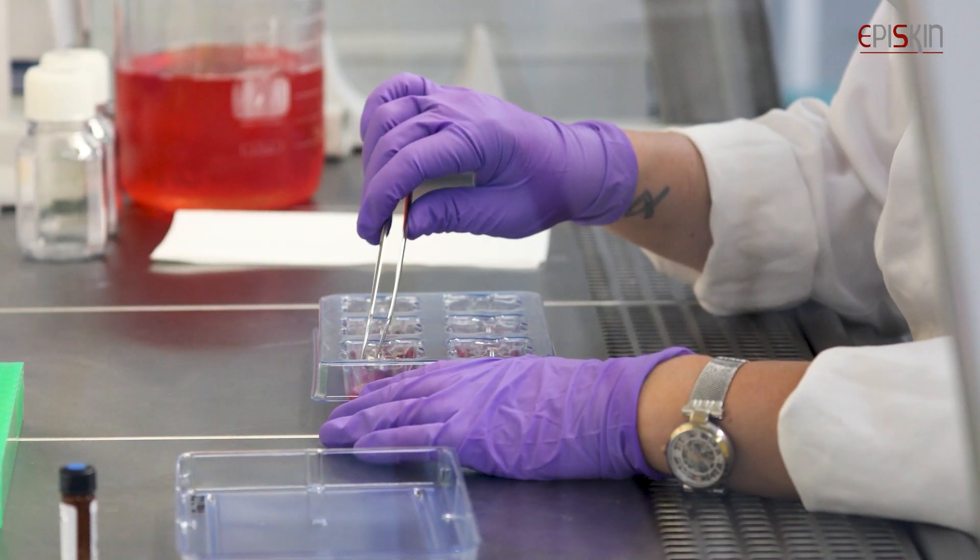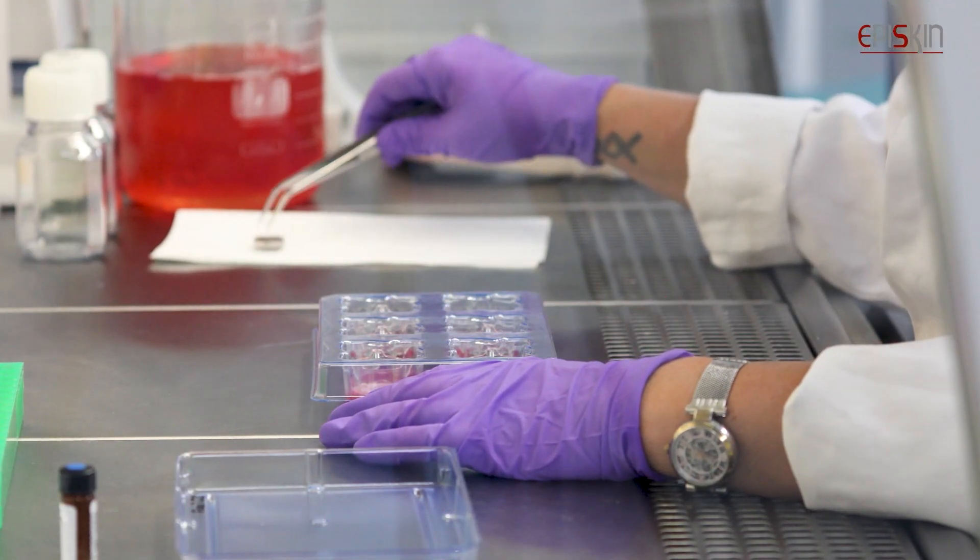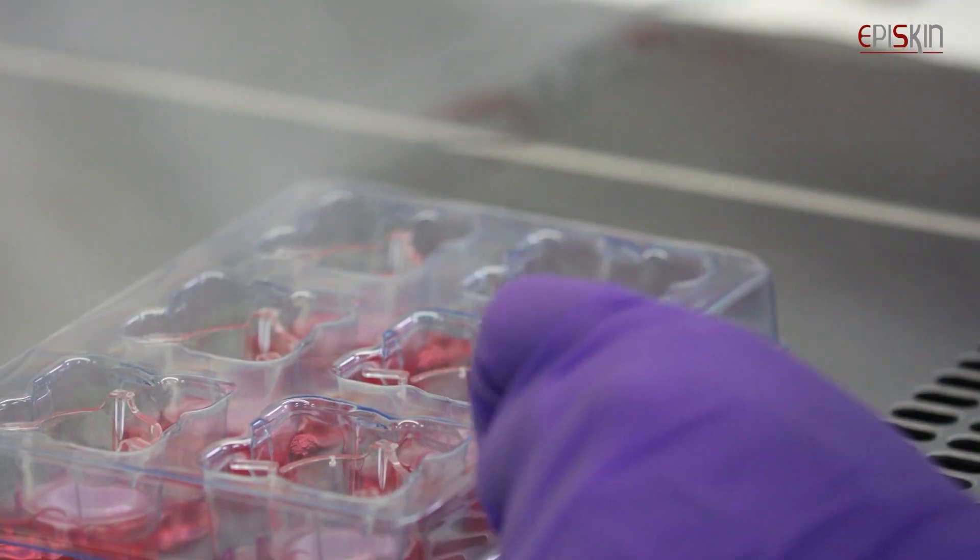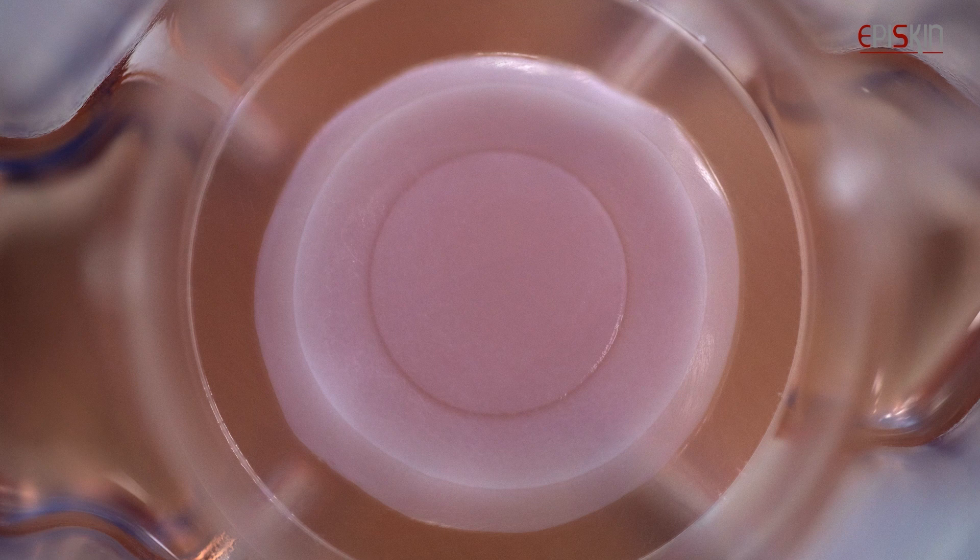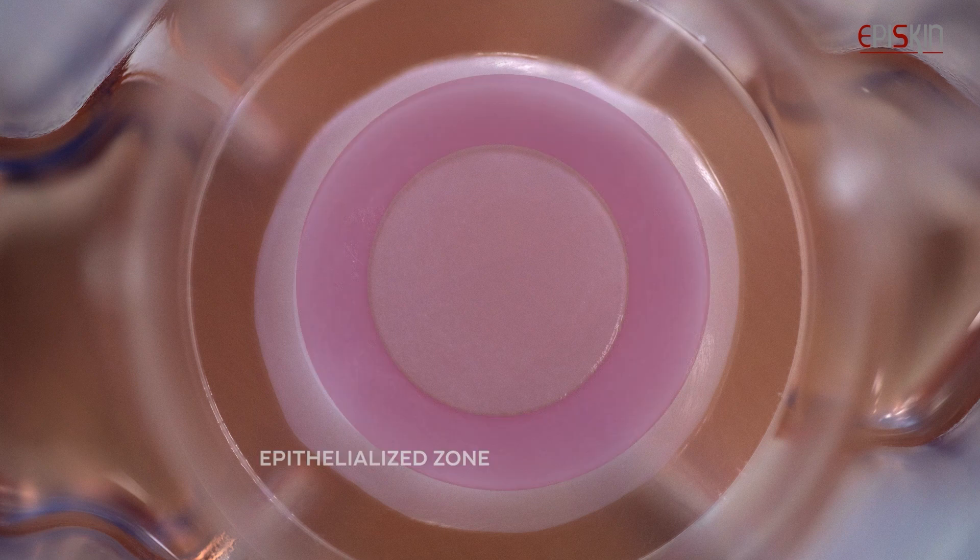During the production step, the keratinocytes are seeded on the outer part of a stopper ring. After six days of culture, rings are removed. This leads to a non-epithelialized zone in the inner part of the model.